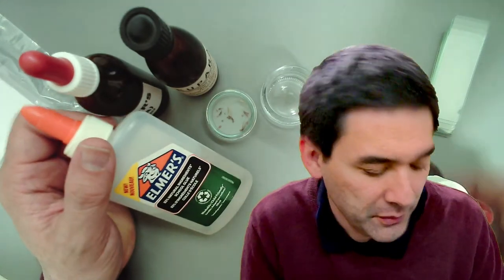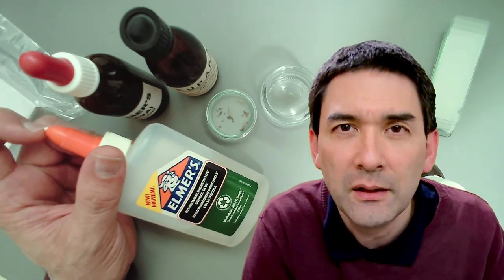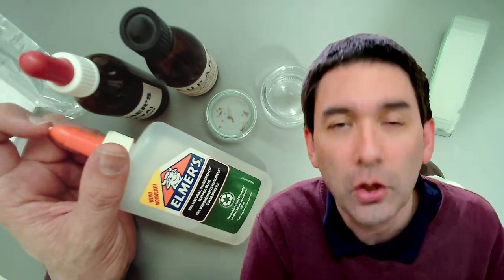Okay, some comments here. Elmer's is amazing. Even after it dries, you can put the slides in warm water and it'll dissolve. So you can redo permanent slides if you're not happy with them, and super cheap. Yes, thank you for that comment. It refers to this glue here, Elmer's, not white glue, clear glue. If for whatever reason the permanent slide mount did not work out, you can dissolve it again.